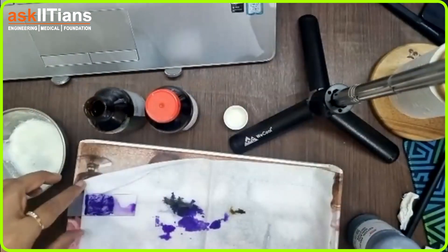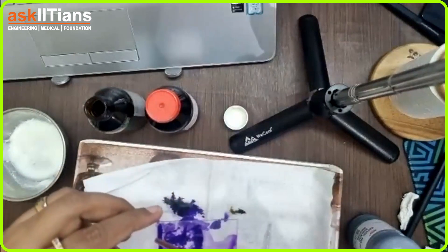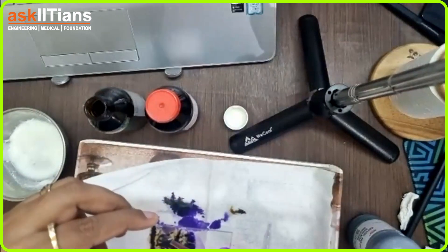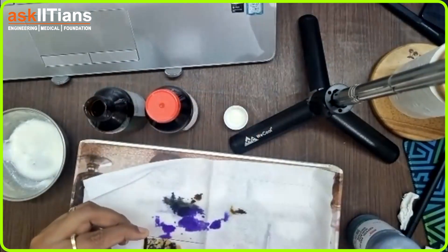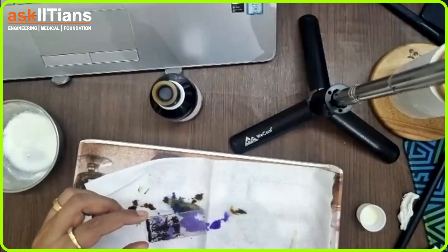Now let's use iodine over the slide. You need to remember this step. Let it stay for a few seconds, then we will again take the water sample and wash it off.